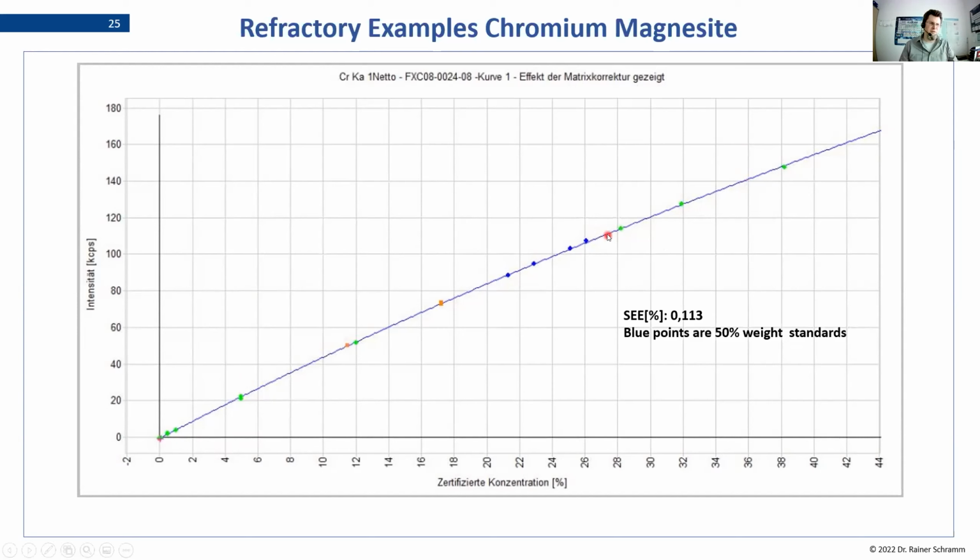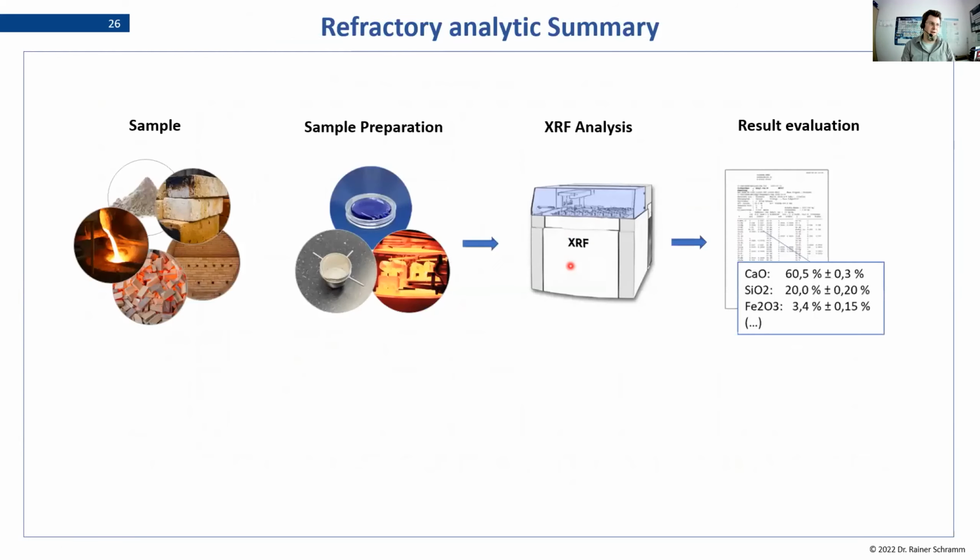The thing is, by using this double dilution, we kind of trick the software and we come back to a linear area of our calibration curve. So in the end, to prevent problems in preparation, we do this trick and we solve it mathematically then.